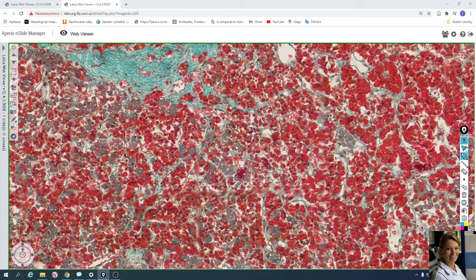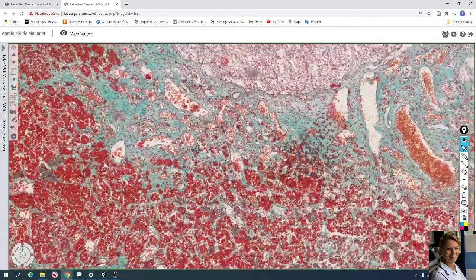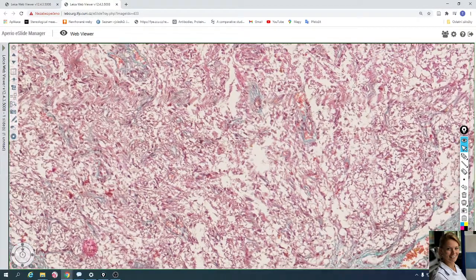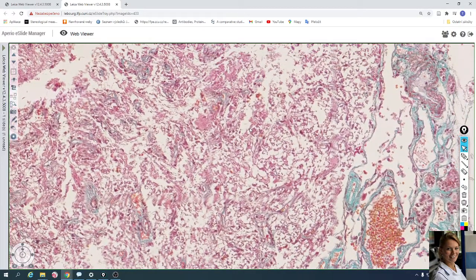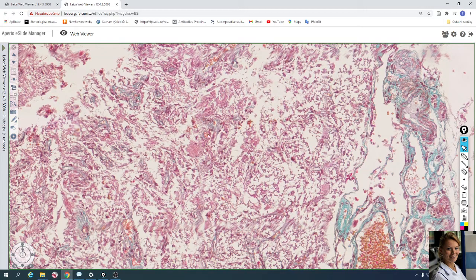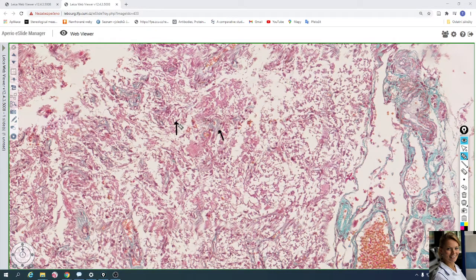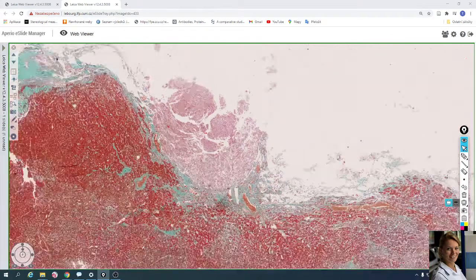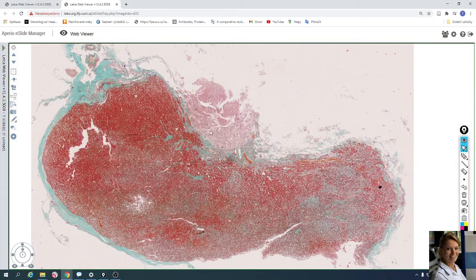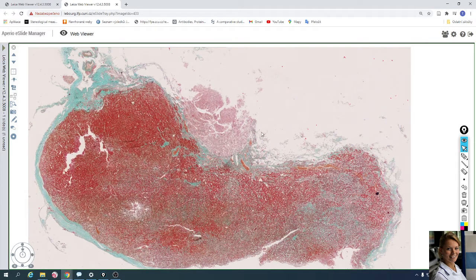Here is the anterior lobe and here is the posterior lobe with pituicytes and capillaries. For example, here is a capillary with an erythrocyte inside and two darker pituicyte cells. This is all for these two staining methods. Here is the anterior lobe with three types of cells, and here is the posterior lobe of the hypophysis, or pituitary gland.